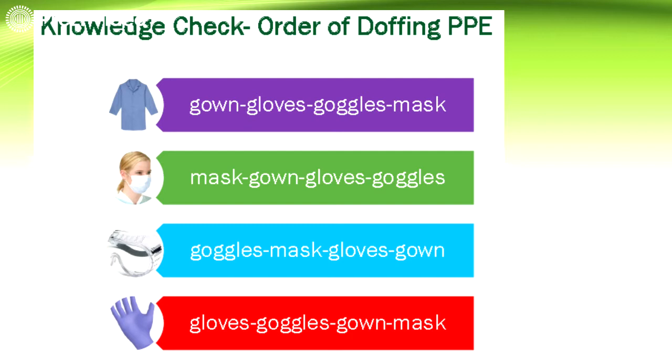So, bakit kaya importante ang doffing? Ang doffing kasi pagdating sa biosafety, this is of importance para nga naman hindi ka magkaroon ng infection. Para hindi ka mahawa kung ano man yung sakit na mayroon. Kasi nga naman, tandaan nyo, yung gloves, that is the dirtiest part of your PPE. So, kailangan mo nang alisin yung gloves.